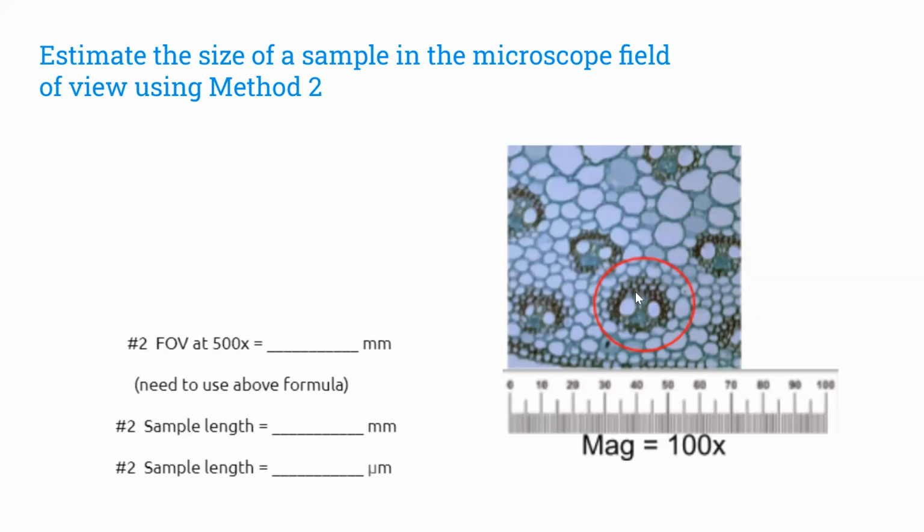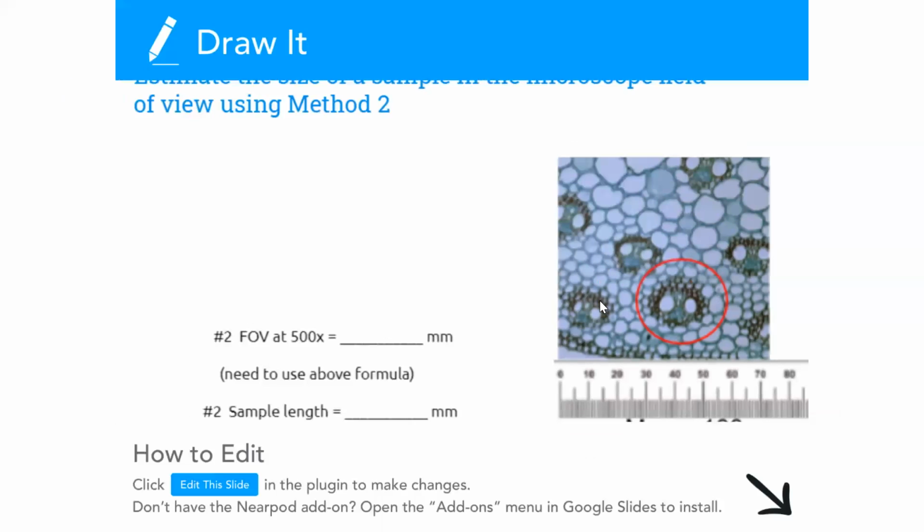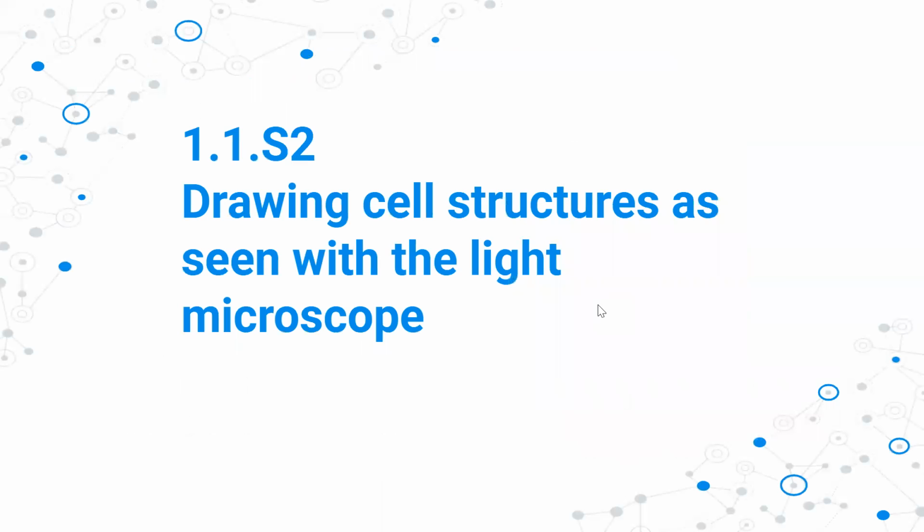Okay. So the next thing we're going to do is we'll get microscopes out. Half of you will use them, and then the other half will have to switch off, right? So what I would suggest is I will get out some slides. You can pick a slide, focus on it. Remember, we all know our field of view at low power, right? We did that last time. So then zoom in to one of the higher powers, whichever one you choose, and find something that you're going to try to measure. Okay, and you're going to do the same process.